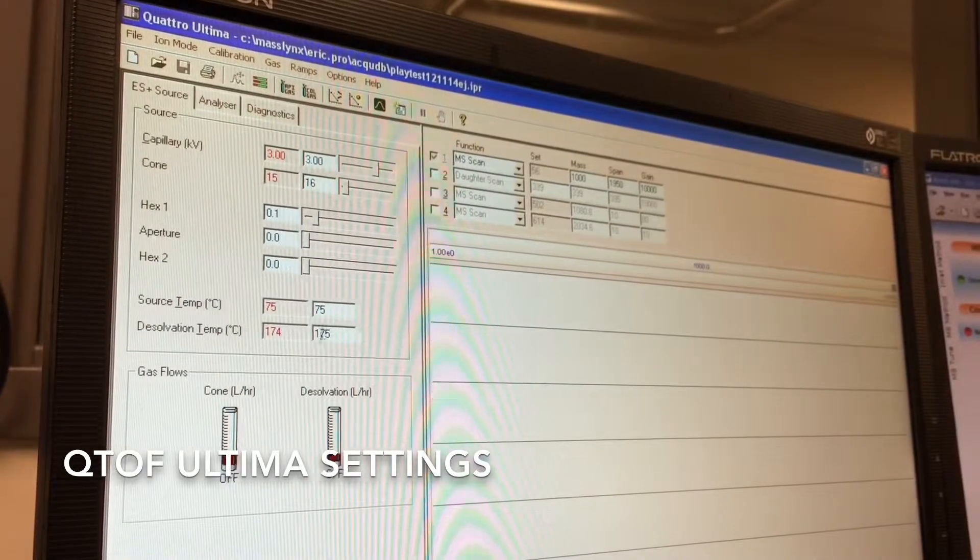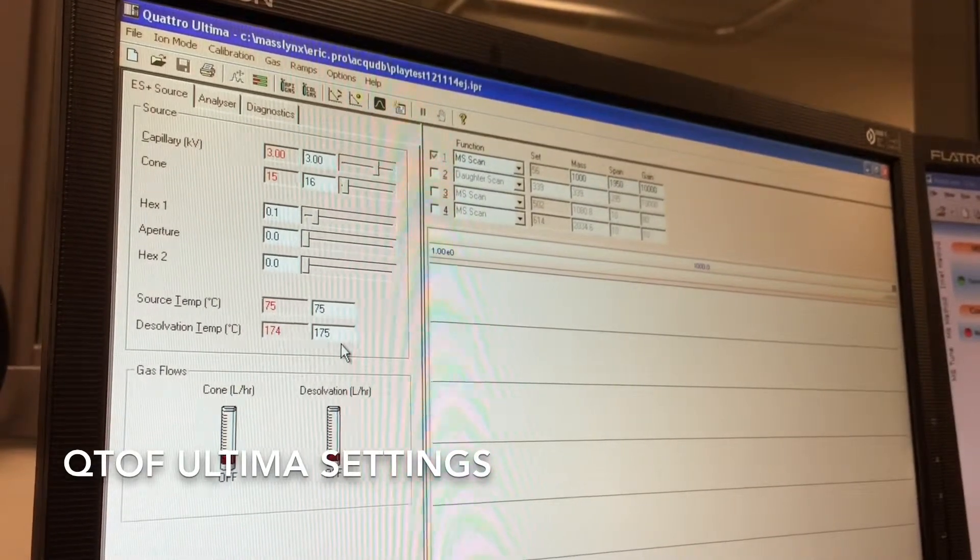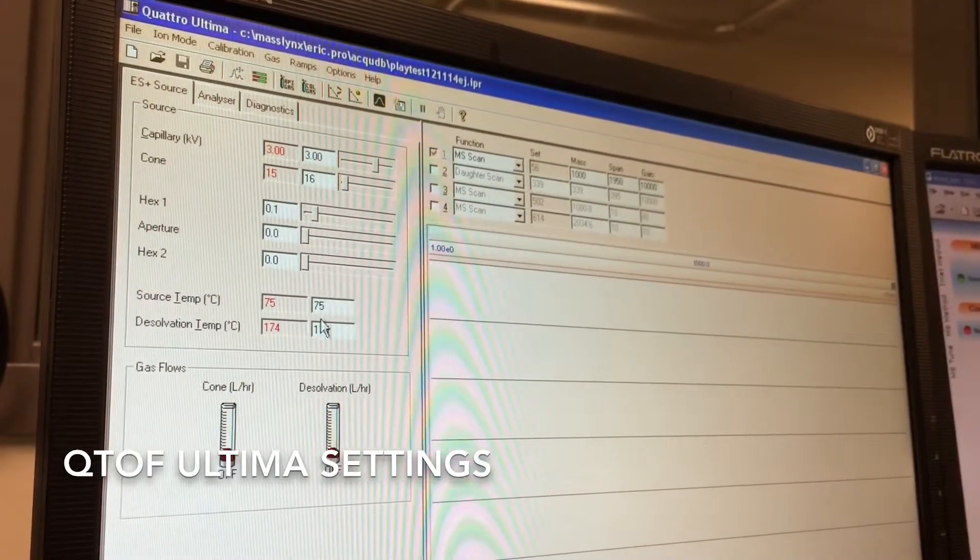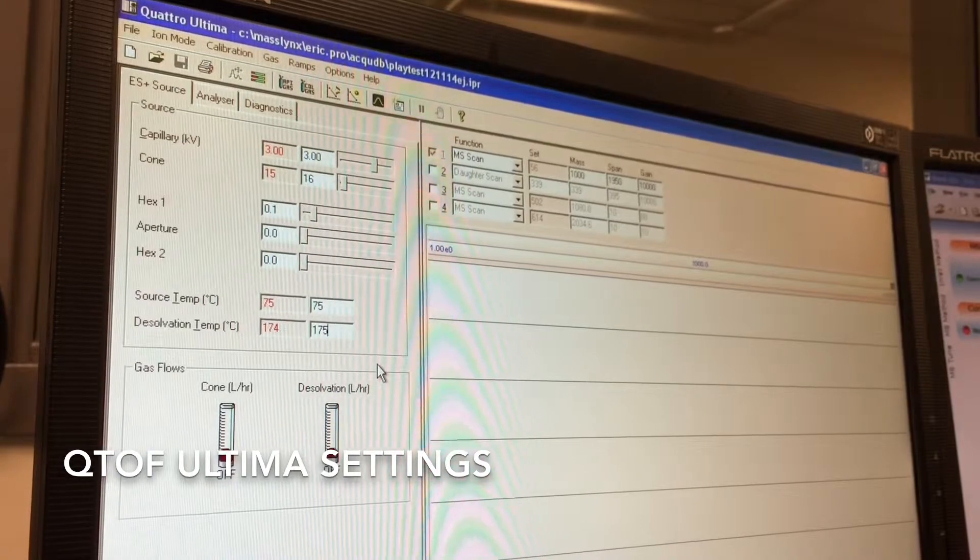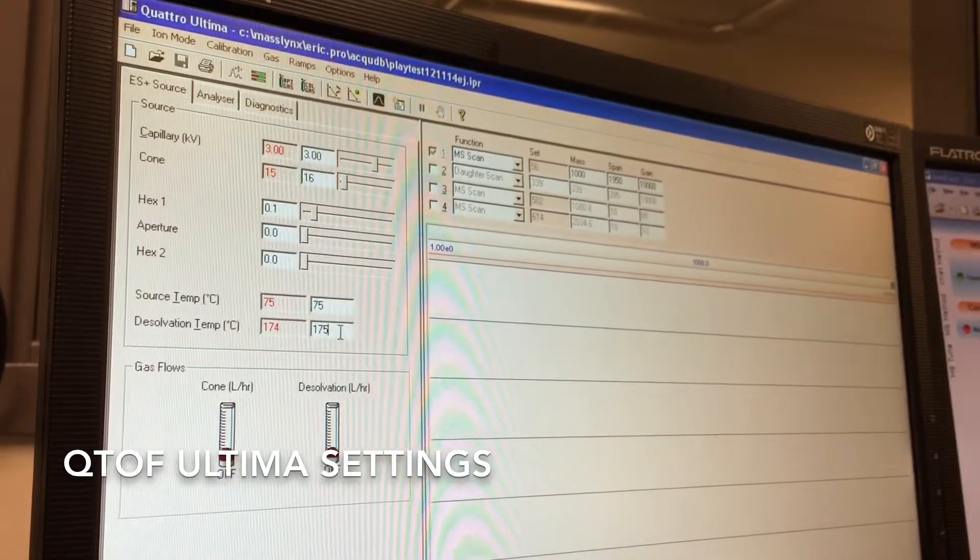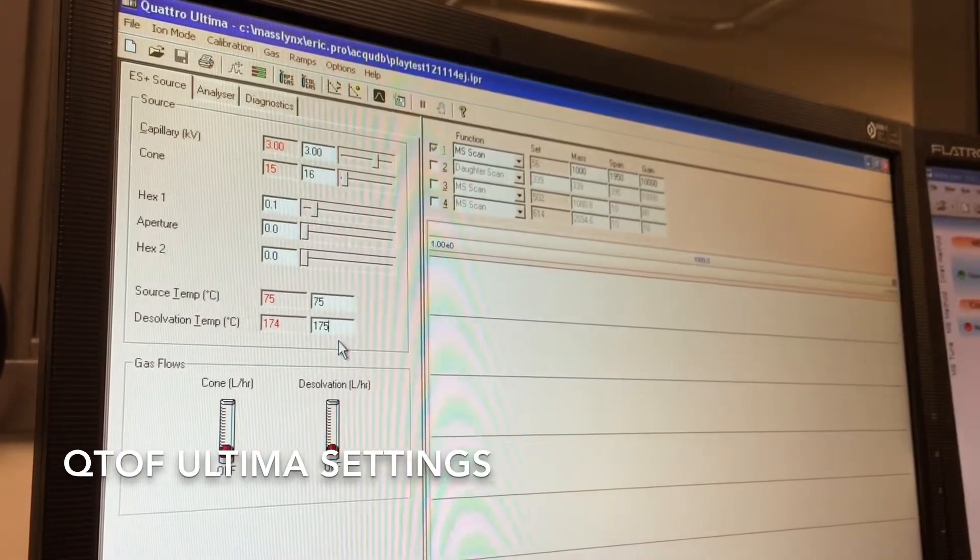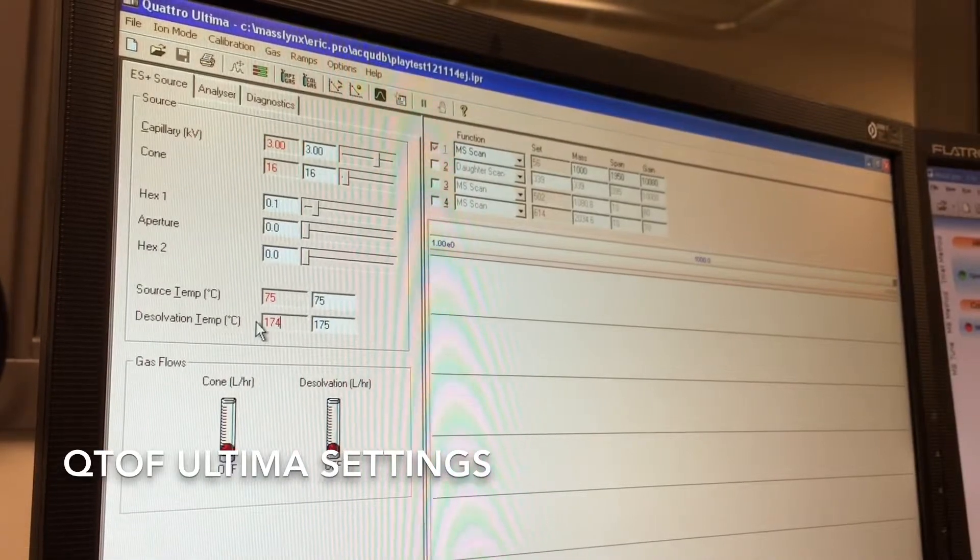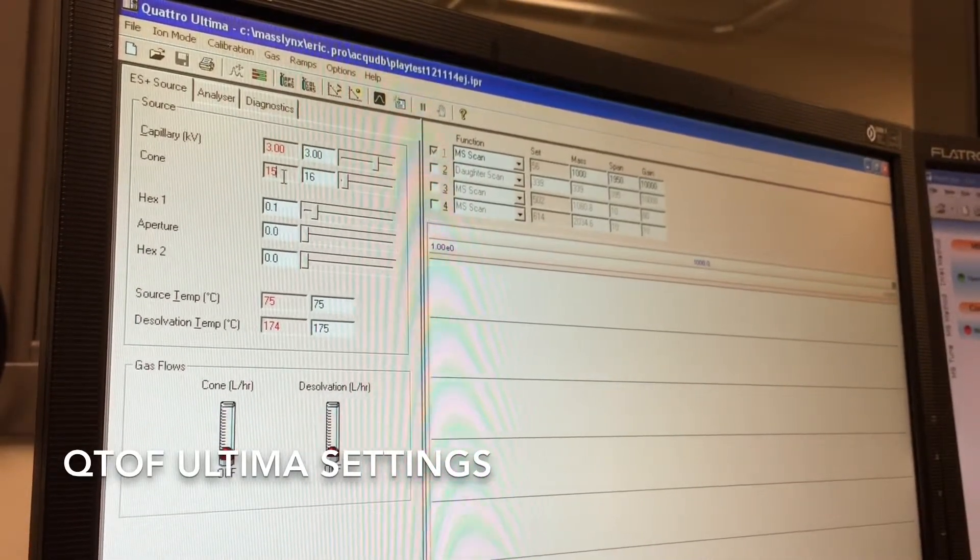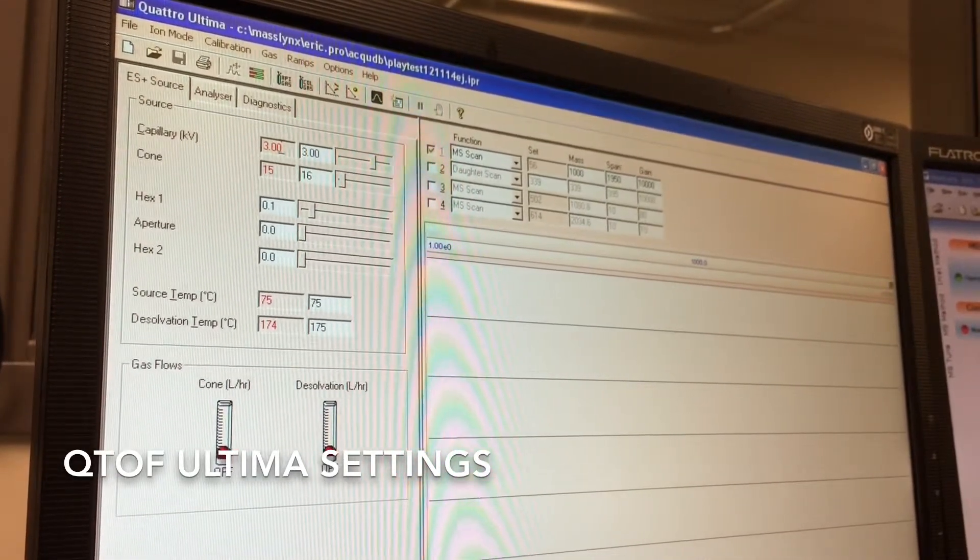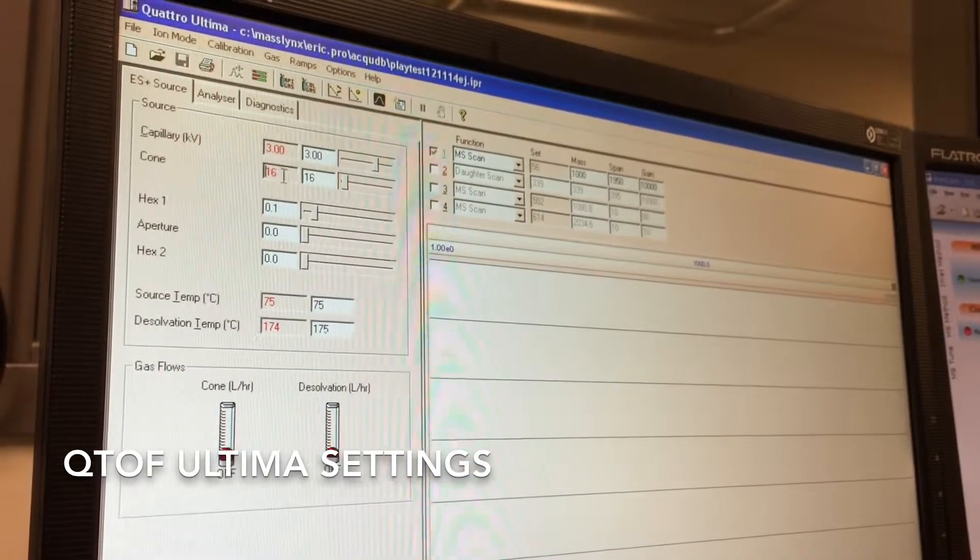The desolvation temperature, you want about 100 degrees above the source temperature. So for example, using water again, you would have this set to about 200 degrees. Over on the left-hand side, you can see what temperature it's currently at and also what voltages the capillary and cone are currently set at.